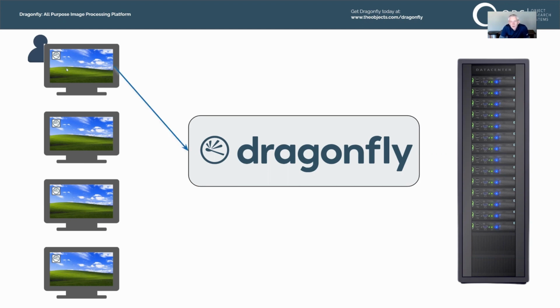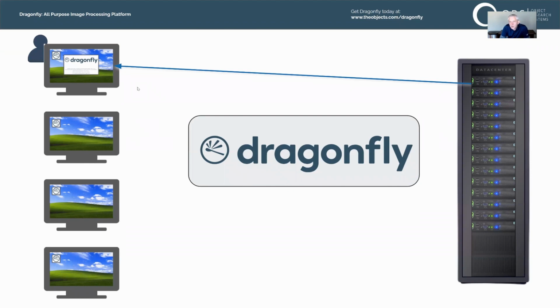What happens more or less automatically behind the scenes is it goes to the Dragonfly VizServer service, and the Dragonfly VizServer service looks and says, do we have any available computers ready for Alice to use? It finds one, it establishes a connection for Alice. All this happens in a matter of seconds. Alice doesn't see anything until all of a sudden the splash screen for Dragonfly shows up. So just like launching Word or Excel or PowerPoint or Dragonfly Workstation, you click the button, and then a moment later, you see the splash screen. And then before you know it, you're processing data.